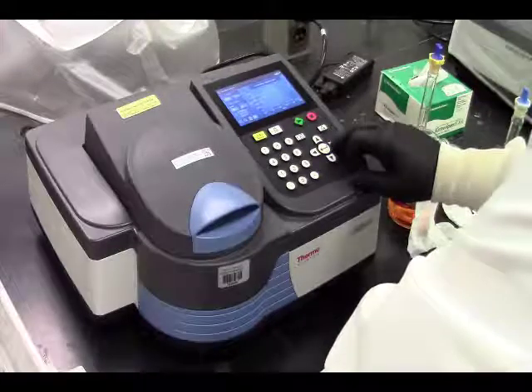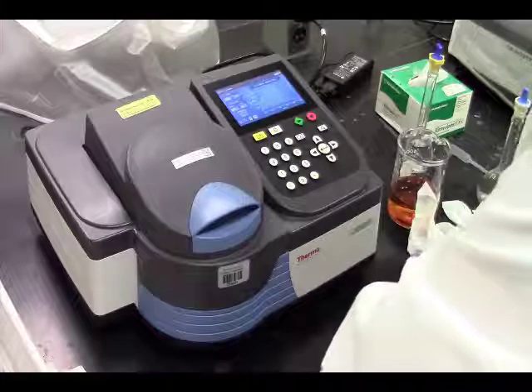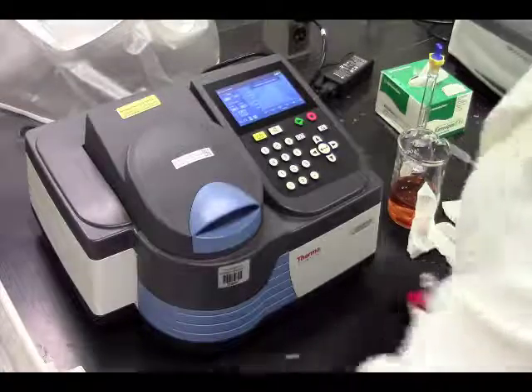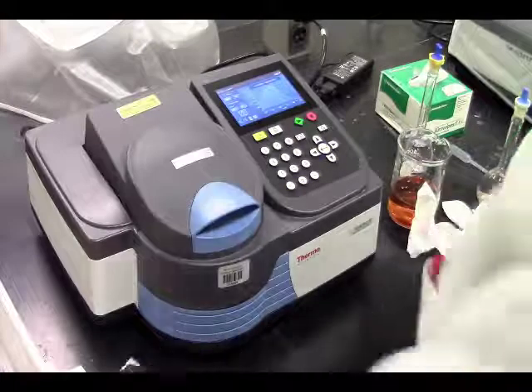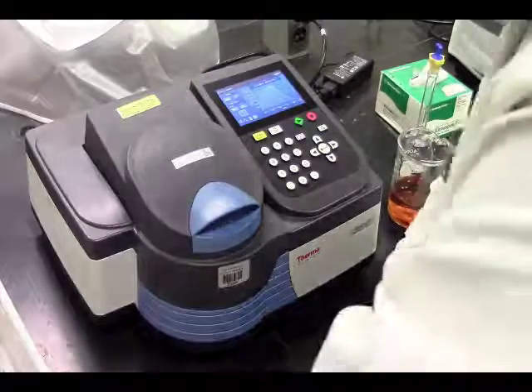At 510, we have 0.020. All right. Now, that concludes this experiment other than cleanup, which I'm sure you do not need to see me do.